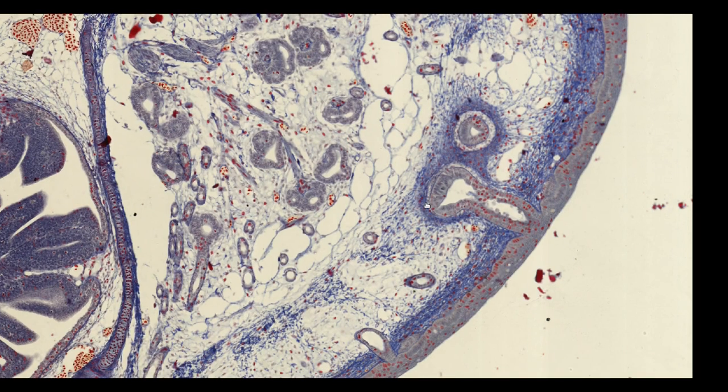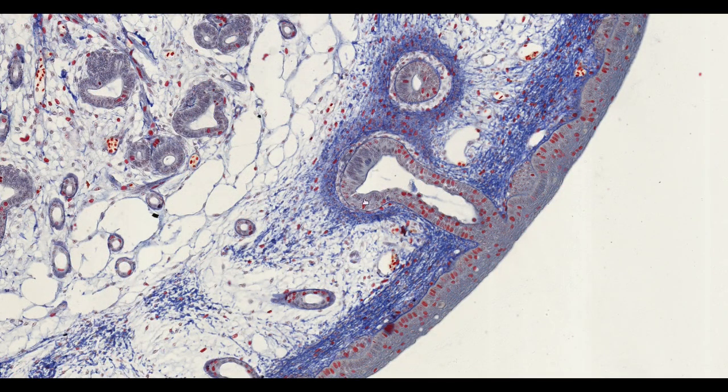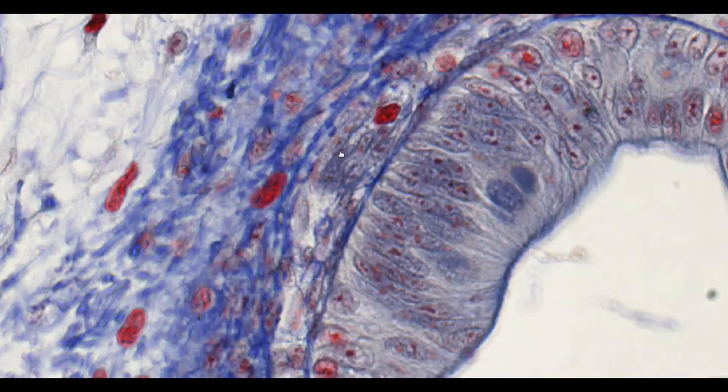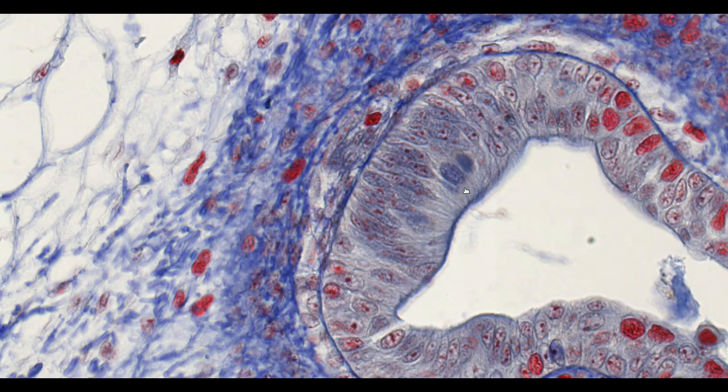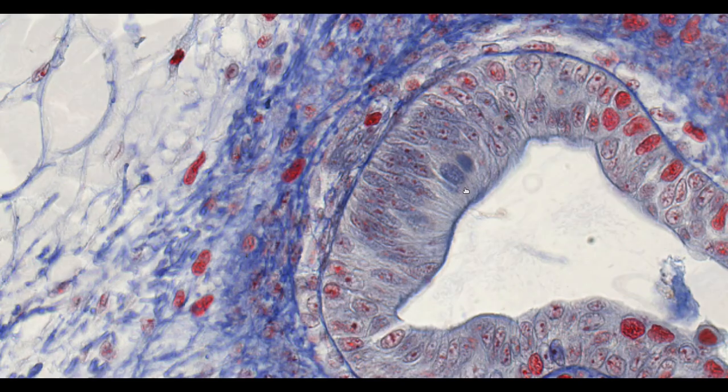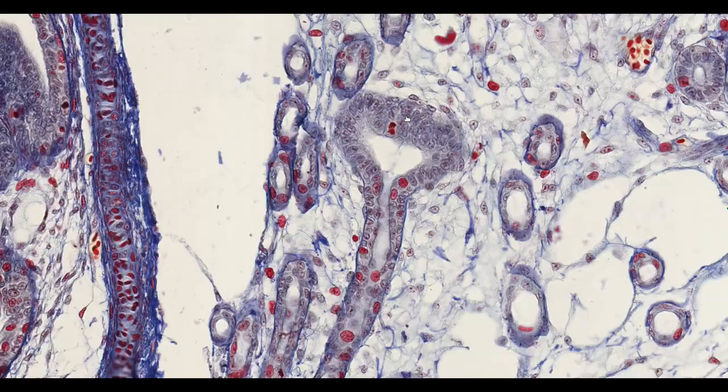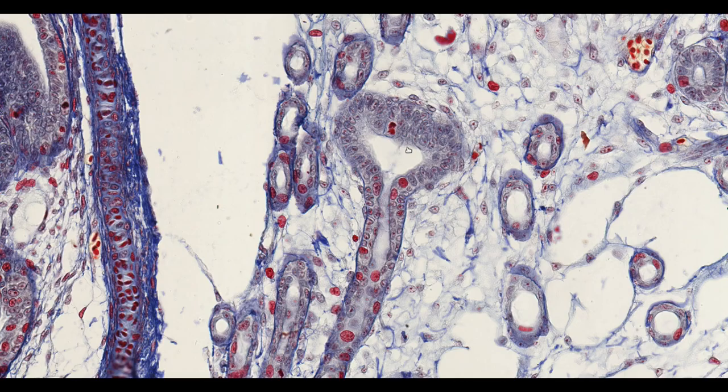Just here there is a great example with the pore nearly opening onto the surface of the skin. At the base we can see a thickened area of epithelium with a wispy cell surface. These are the cilia of the sensory cells that detect electric currents. Another good example can be seen here where a long duct heading from the skin culminates in a widened area with ciliated cells lining the epithelium.